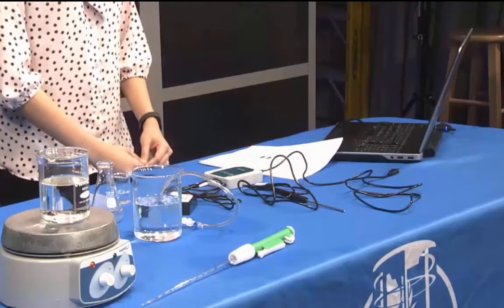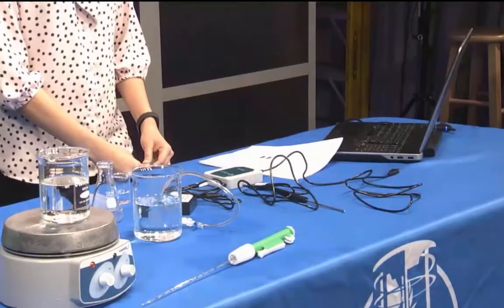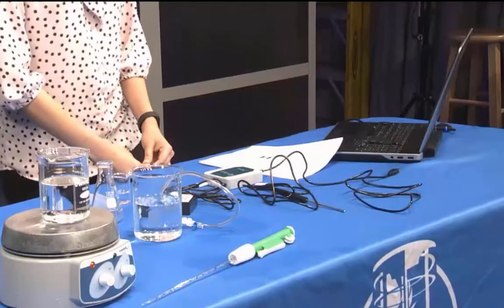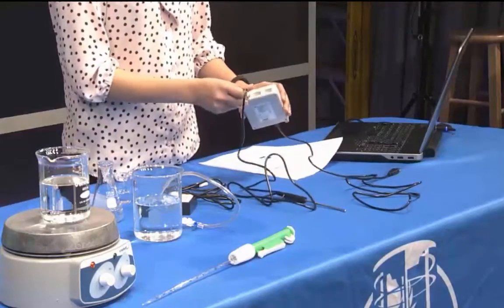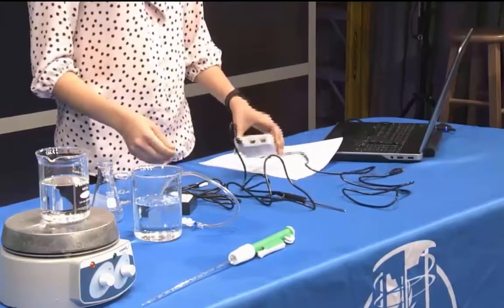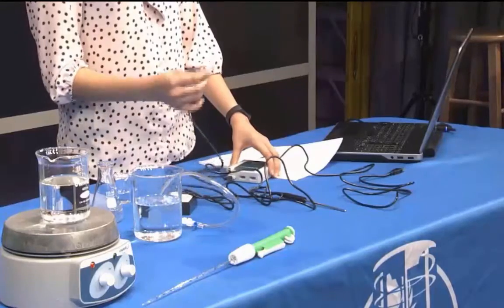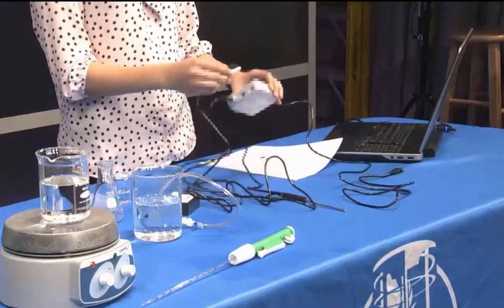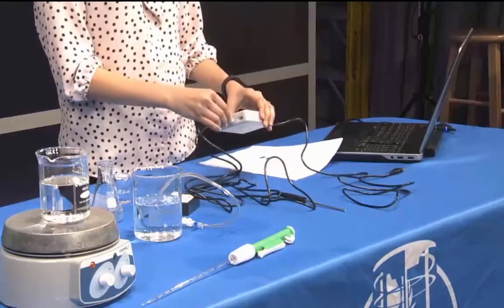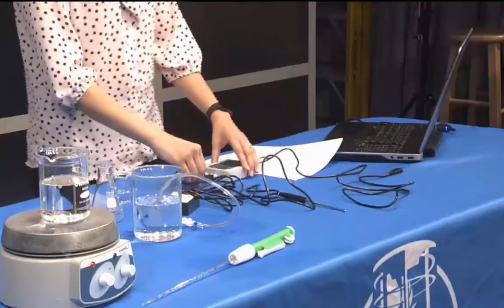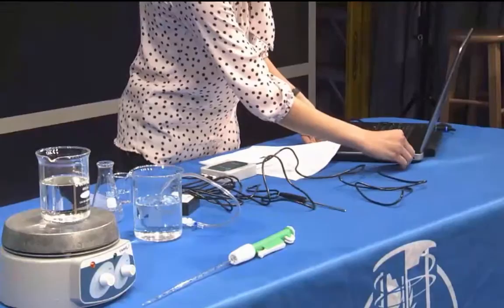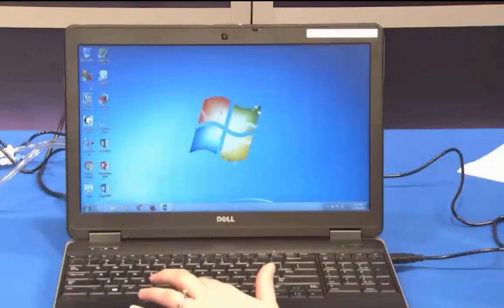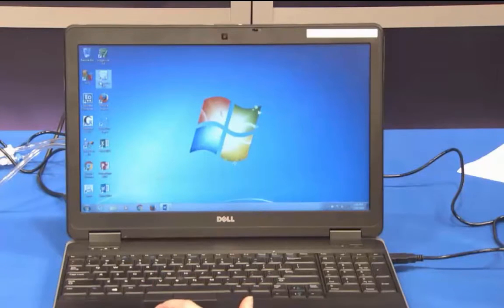First, you need to measure a room temperature and pressure reading. To do this, connect the temperature probe to one of the channels of the LabQuest box, then connect the pressure sensor to another channel of the LabQuest box, and then connect the LabQuest box to the computer.